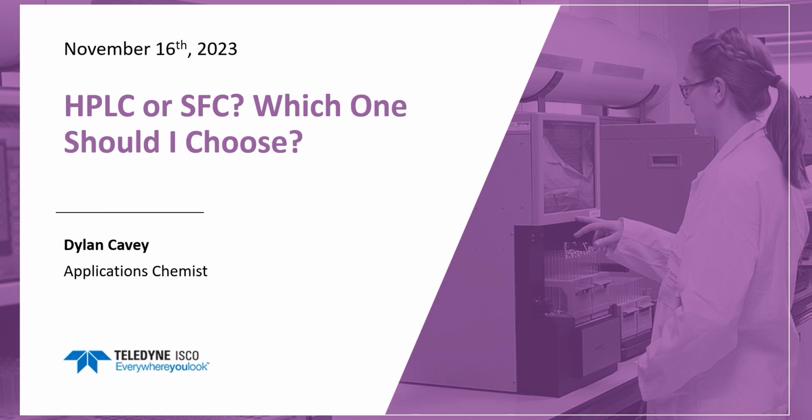Hey, thanks everyone for joining today's webinar. As previously mentioned, I'm Dylan Cavey. I'm an applications chemist here at Teledyne ISCO, and today I'm going to try to help you decide when to use HPLC or SFC. A lot of that's going to come down to the analytical needs of your laboratory and what compounds you're looking to separate and purify.